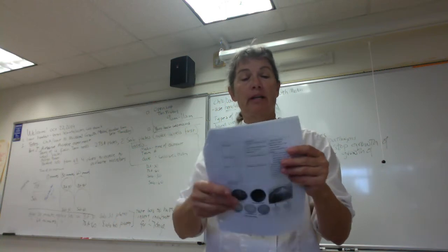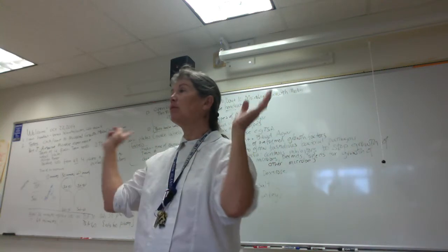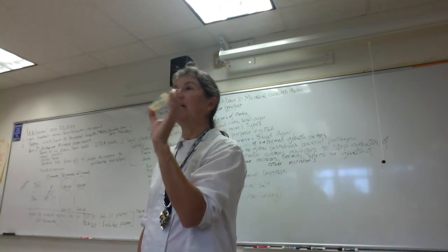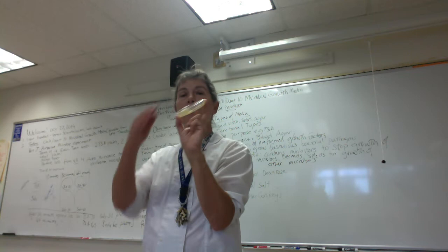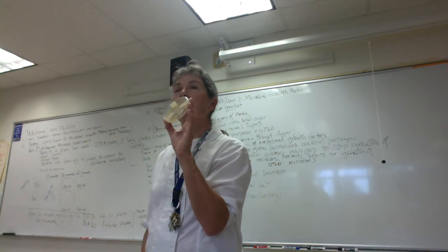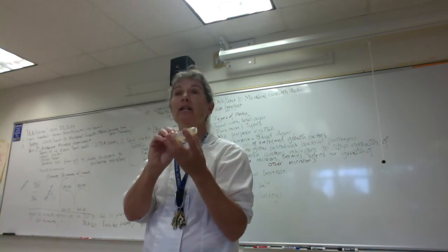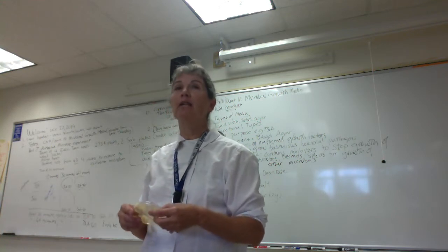All right, okay, so another point here, folks, is in our lab, let's say we're talking about our plates. Can we grow in our lab strict or obligate anaerobes on our plates? What do you think? The microbes growing on the surface of your agar, do you think they could be strict or obligate anaerobes? No, right? Because what's present on the surface of the agar? Oxygen, right? So in our lab, we don't have the facilities to grow strict or obligate anaerobes.